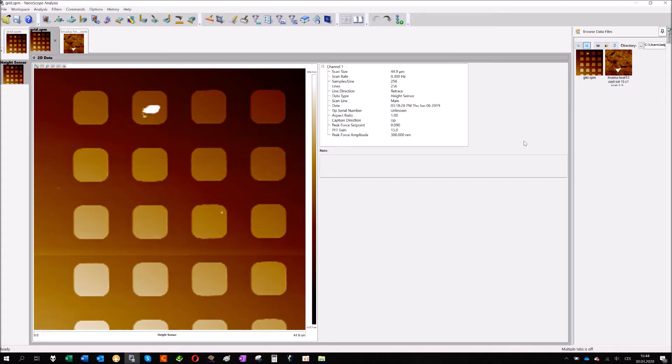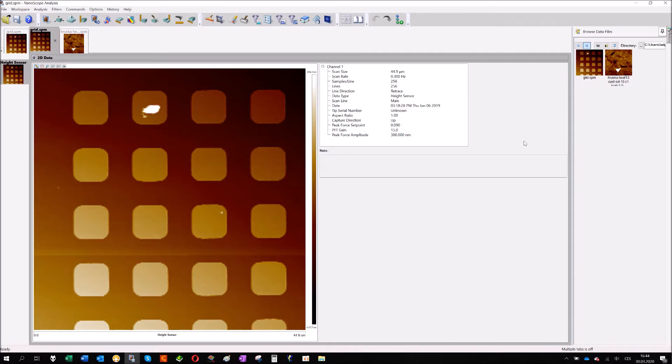Hello everybody, my name is Vladislav and I prepared for you a series of videos about image analysis for AFM. I will start with Nanoscope Analysis software from Bruker Corporation.